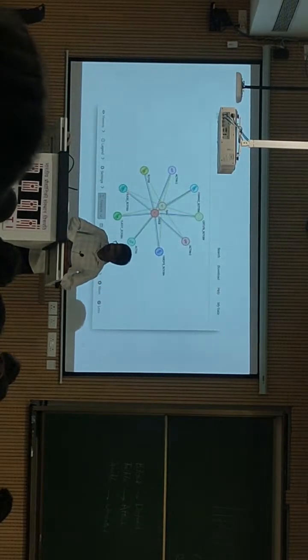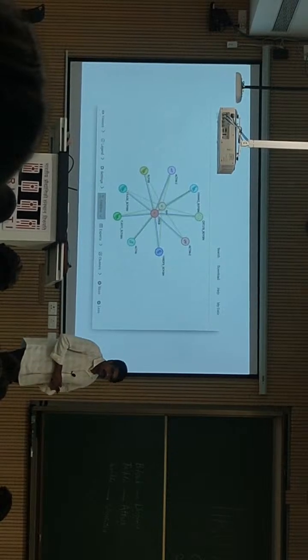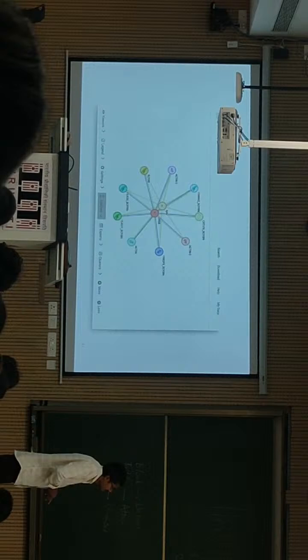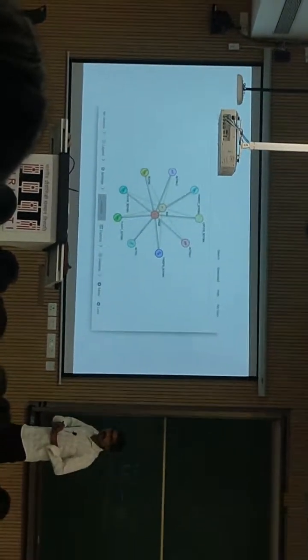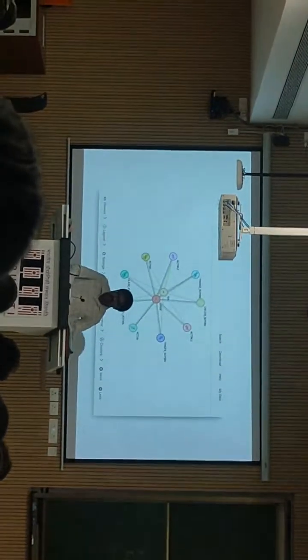Like in between, the DREB, the dark red color protein, is my protein. Just as an example, how this protein interacts with other proteins like actin. Actin is a normal housekeeping control gene, you know. And then how this protein interacts with the various soybean related proteins, we can easily identify using this software. But we need to generate the 3D model.